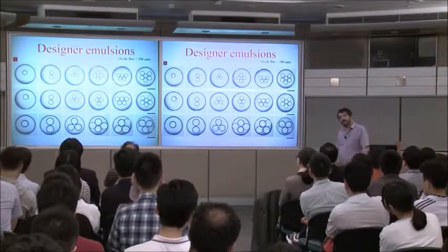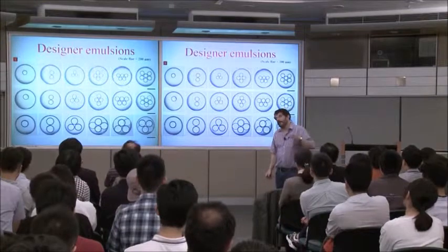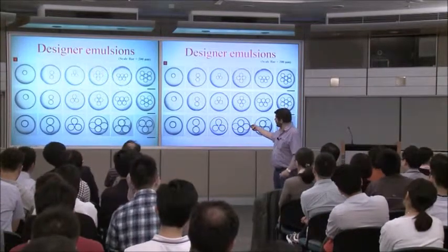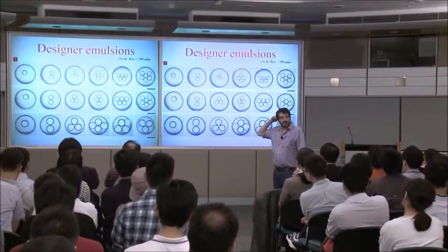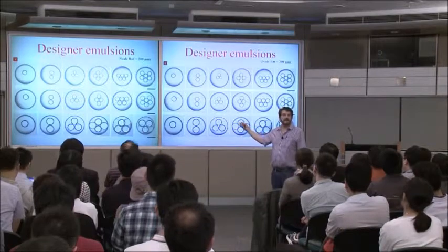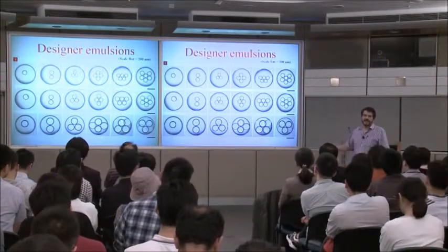So now, you don't make just core shell structures. You want the core shell structures. I say, okay, well, how many drops do you want inside of them? And you tell me you want 5. I say, well, what size do you want? Not only can you control the number, but you can control the size very easily because each flow is perfectly well controlled. So Liang-Yin showed me that.